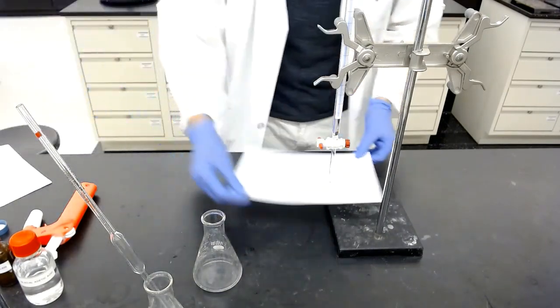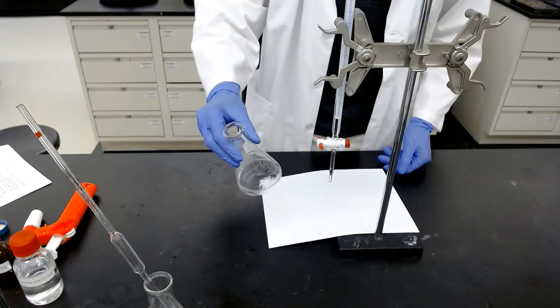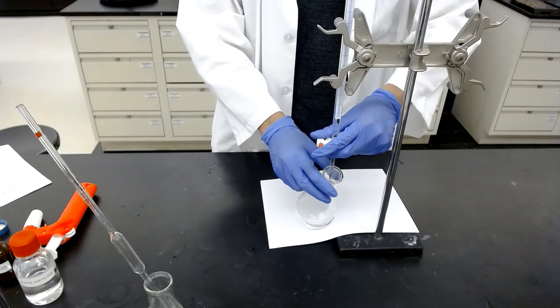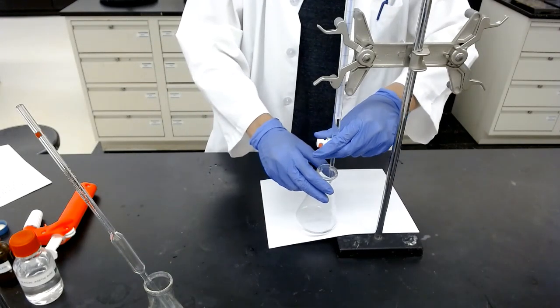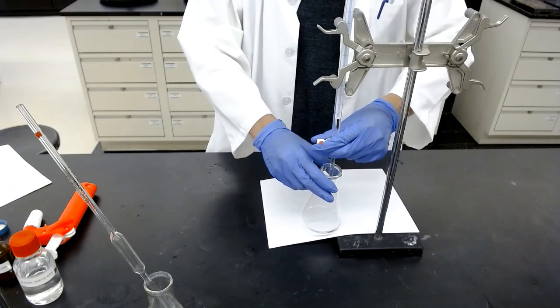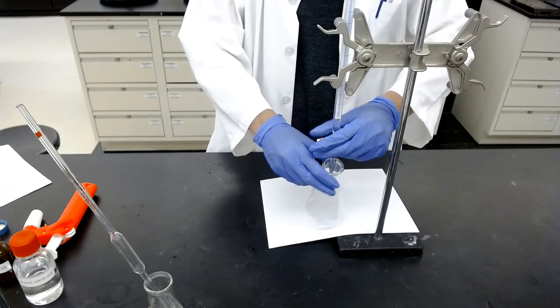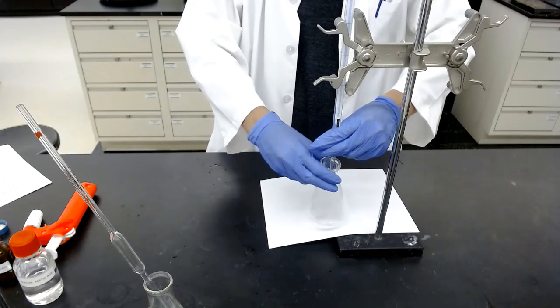Bring the white paper over for the contrast. And I have refilled the burette already up to 0. We're now ready to do the titration. Okay? So the question is, do we need more acid or more base to do the titration?